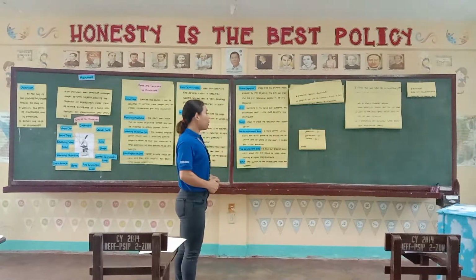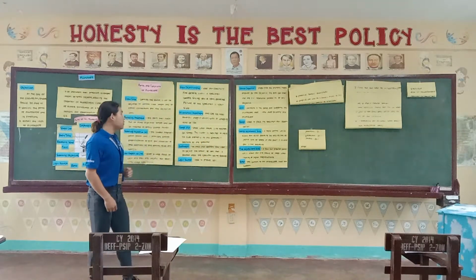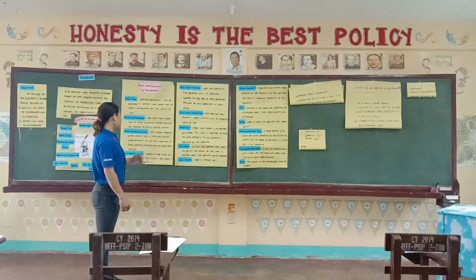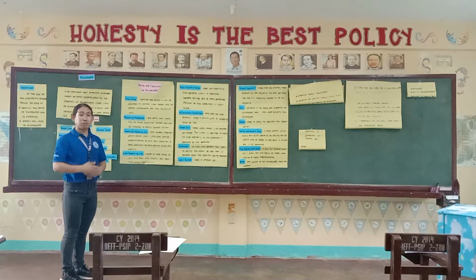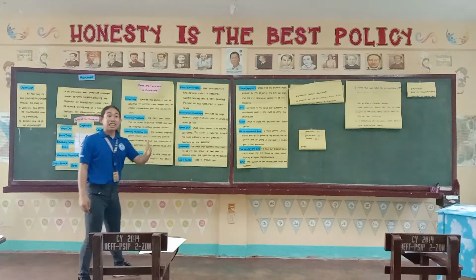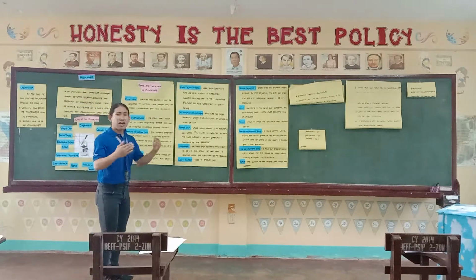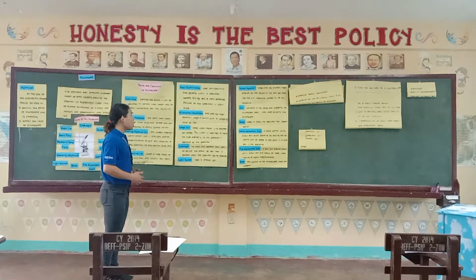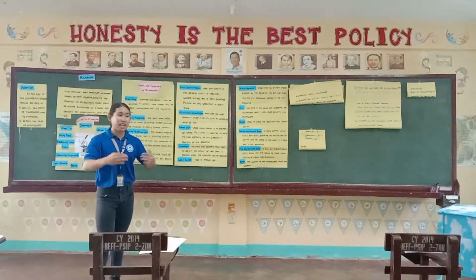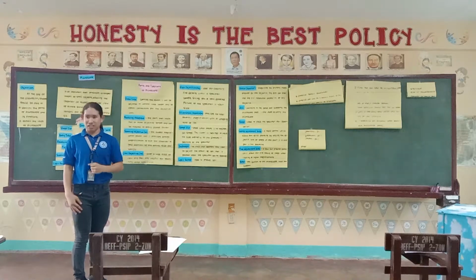Okay, so the oil immersion objective provides the most powerful magnification with a whopping 100 times magnification. Meaning the oil immersion objective has 10 times the power of the low objective magnification. It can magnify so powerfully that in a structure you can clearly define details. So makita niyo ang mga fine details sa isa ka structure using the oil immersion objective.